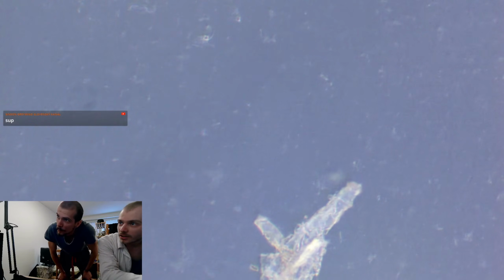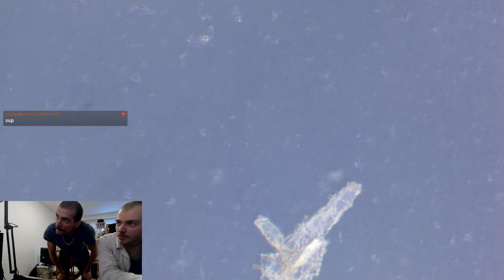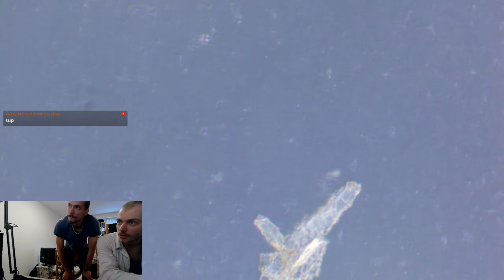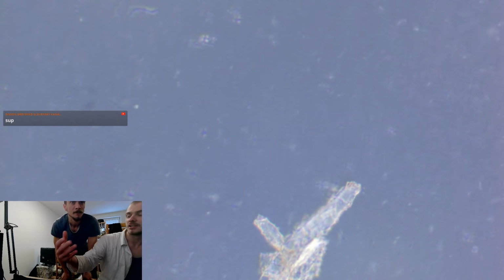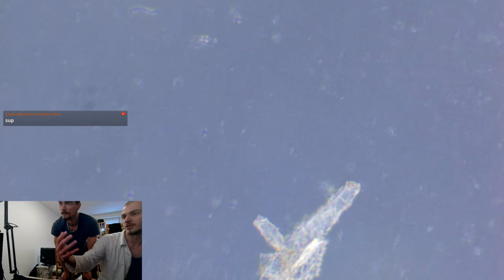Lot of crystals can be found here, but no, this is I think some sort of debris. This is not crystal which I found more times, but there can be really clean looking good structures of crystal sometimes here. But cool debris.